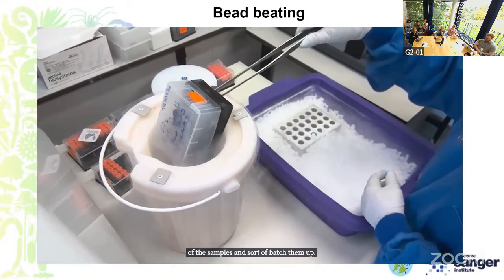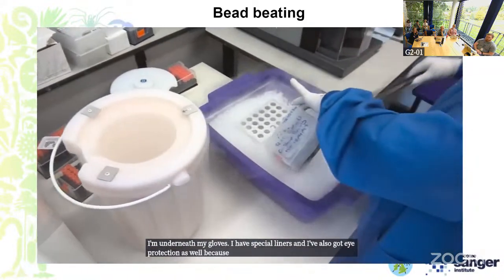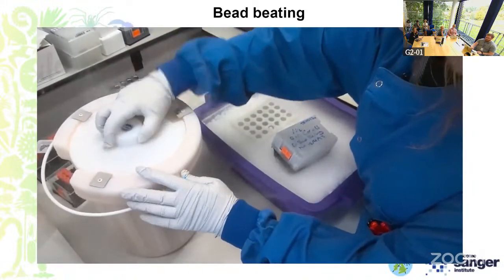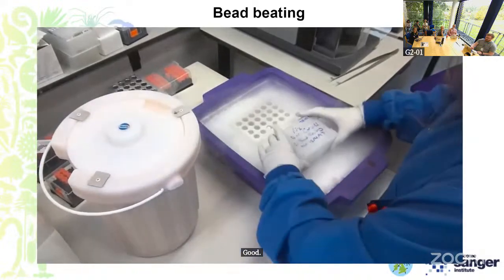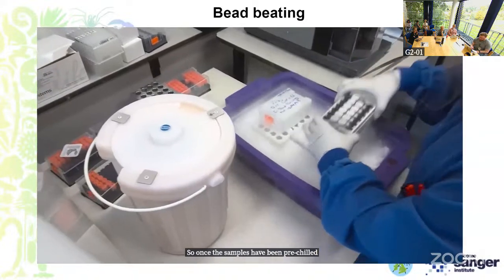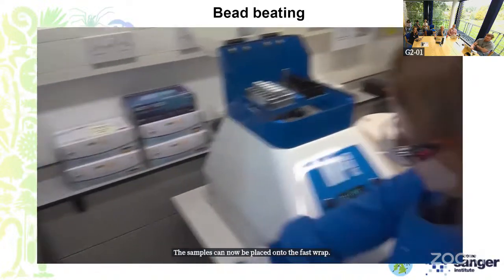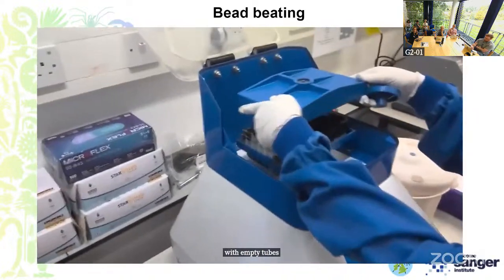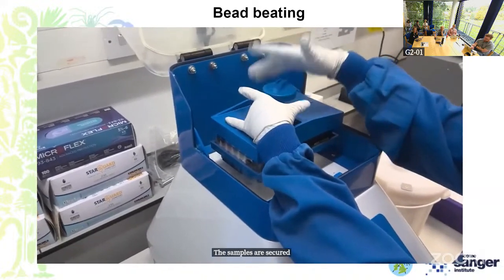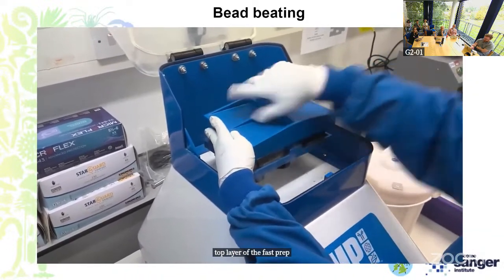Underneath my gloves, I have special liners, and I've also got eye protection as well, because I'm handling liquid nitrogen during this stage. Once the samples have been pre-chilled, the lid can now be taken off, and the samples can now be placed onto the fast prep with empty tubes acting as a balance on the other side. The samples are secured down with the top layer of the fast prep, and I'll make sure that it's nice and tight before proceeding.